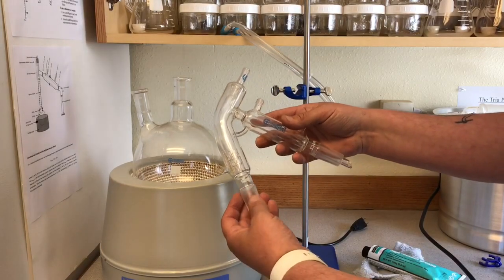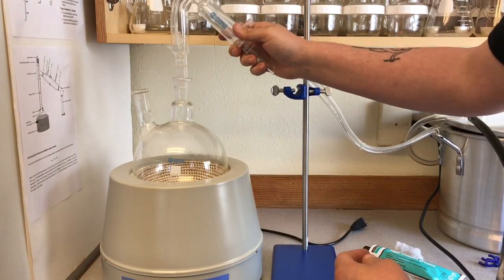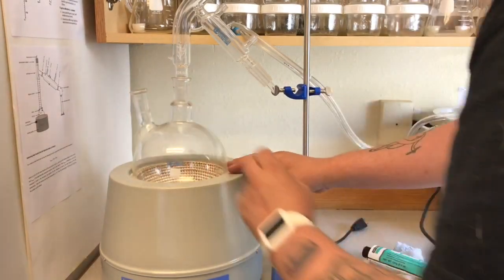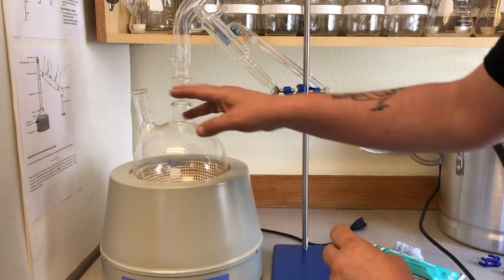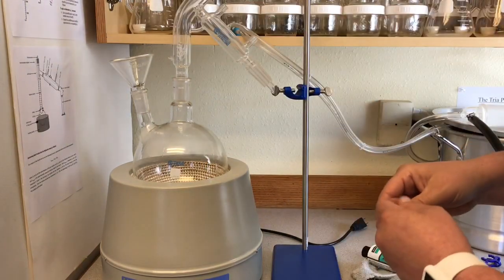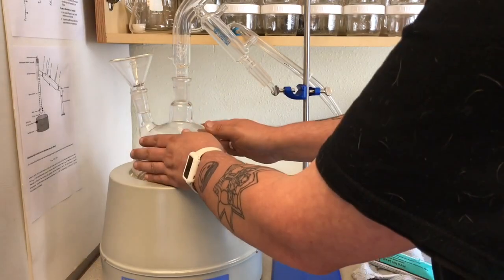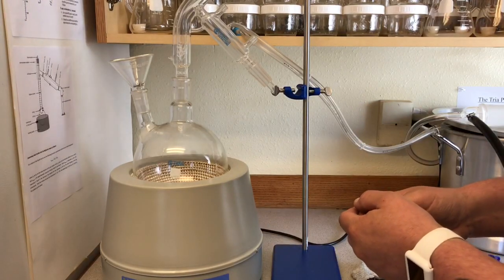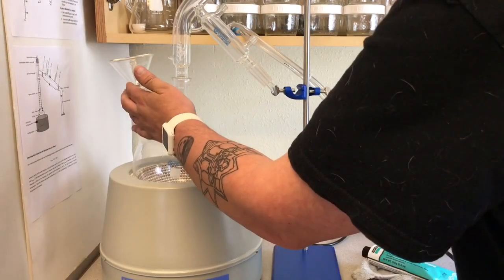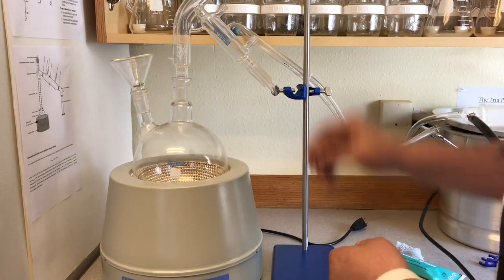The next piece we'll add is going to be our distillation column, or our condenser. And this guy will sit right in here like this. It's important that you keep track of where your other input is. You may wish to use a funnel as you're putting in your material, and depending on which material you run, you may decide that you want to add your material first. If it's a liquid, you probably want to add the material first before you build your apparatus. If it's an oil or something more thick that you might be using a heat gun and a funnel, then you probably don't need to put the liquid material in here first.